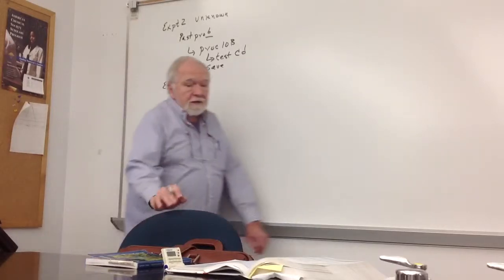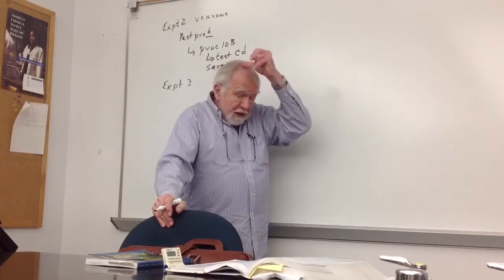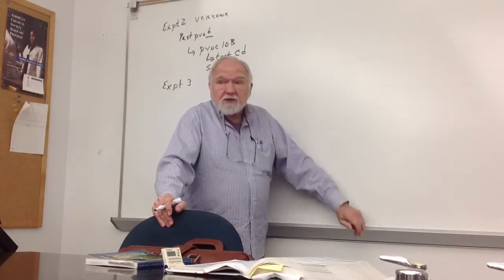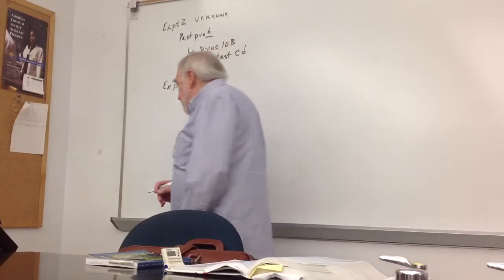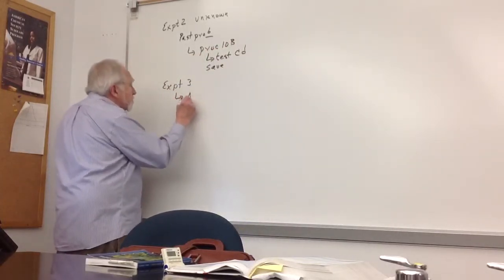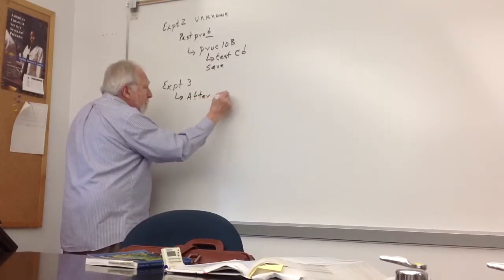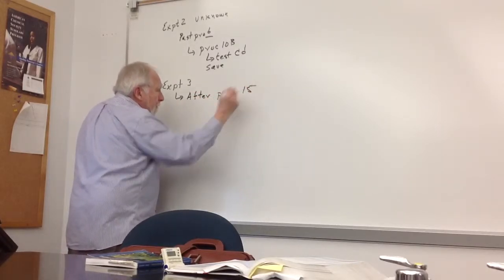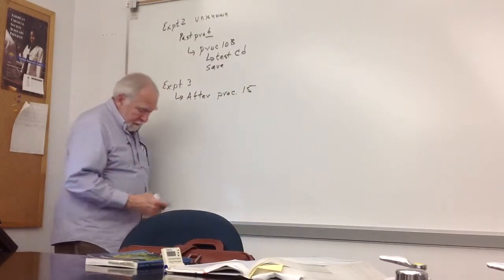after you've completed procedure 15, if you've already completed that, then the rest of the procedures do not require ammonium sulfide. So you can continue with procedures after procedure 15. In order, if you completed 15, you can complete the whole experiment.